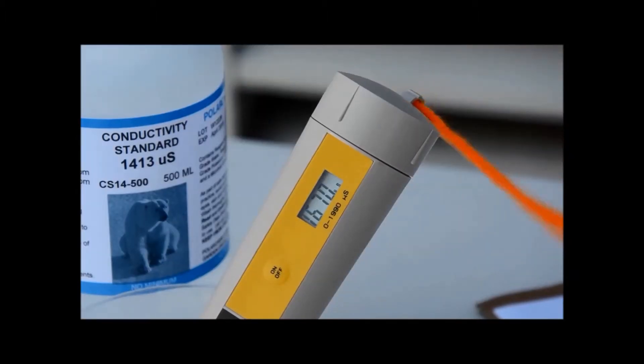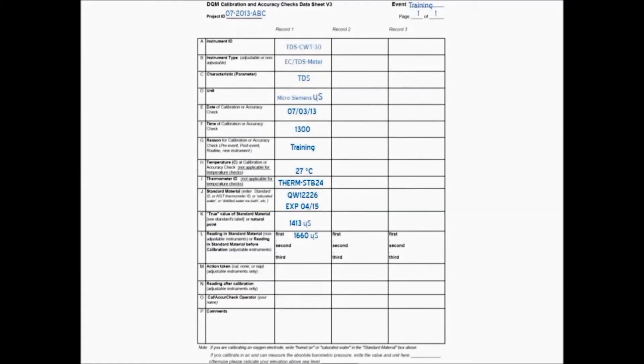If your meter's output does not match the calibration standard value, you'll need to adjust your meter.